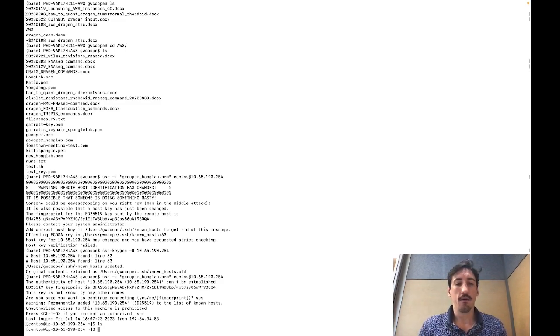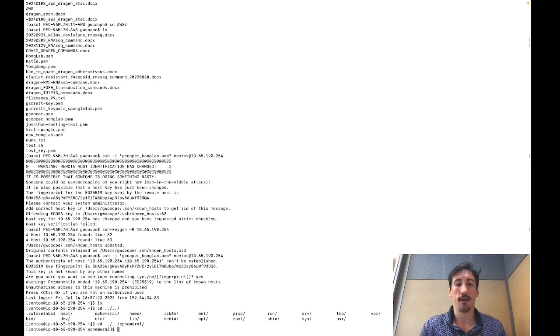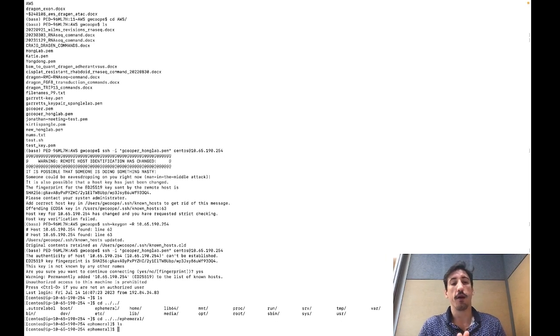And so now what we need to do is navigate to this directory called ephemeral. This is a little strange in that the actual compute power and storage is only in this ephemeral directory. So I'm navigating up 2 directories and down into the ephemeral. There's nothing in this one, but you have to navigate to this directory for this analysis to work.